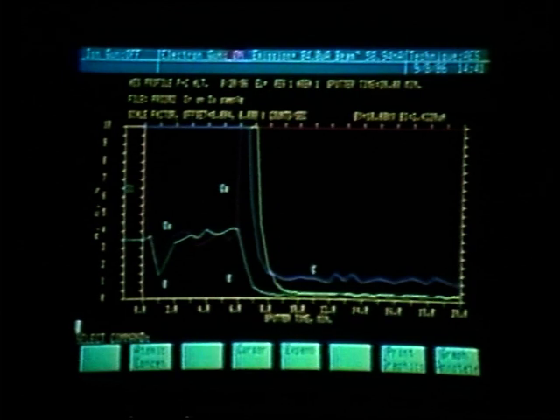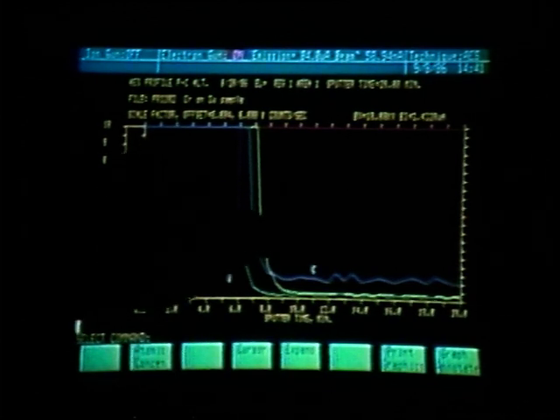We have now demonstrated how to obtain an atomic concentration profile without an element which would give us erroneous data. That is, to display the profile regions which we want included in the atomic concentration profile. We can also obtain atomic concentration numbers, the atomic concentration graph, from any cycle which we choose.